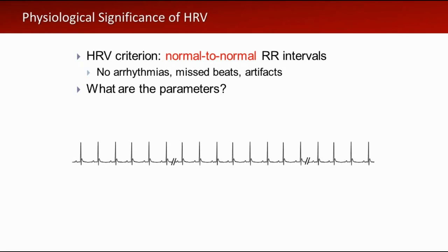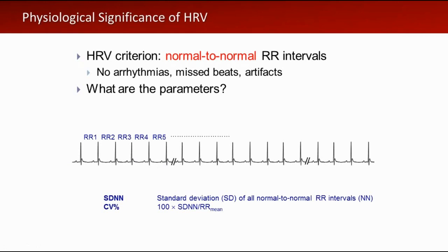So here you'll see a representative waveform we've gotten from our mouse recordings. I would like to point out, I'm going to use my cursor as a mouse so you can see. This is not a continuous recording. You can see we do have some data breaks here, but much of the data I will talk about today is from continuous recordings. So here's a representative ECG waveform. And you have your RR intervals, and again, that R wave is going to be that sharp peak in the QRS complex. And you can see that we've just listed RR intervals in increasing order, just numerically.